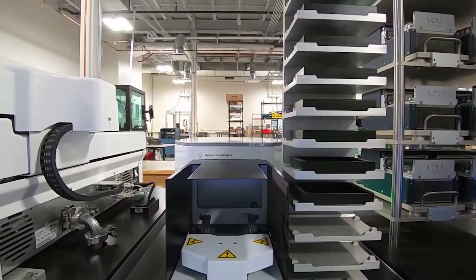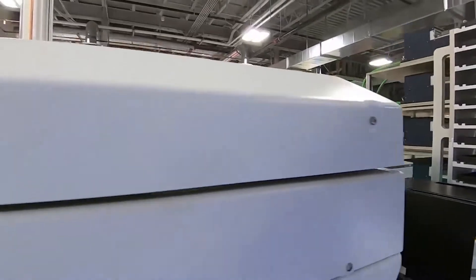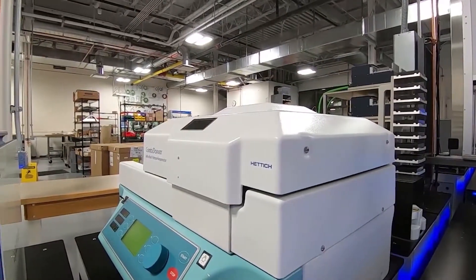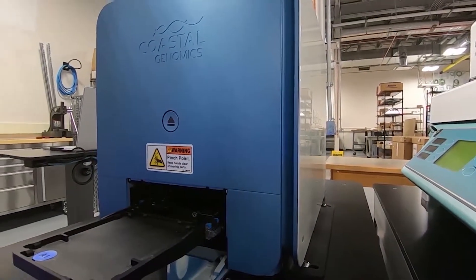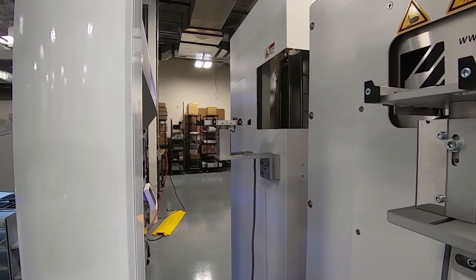We have another centrifuge and then our combi dancer. There's one step where you have to dry down the samples before hybridization, so we went with the combi dancer to dry down those samples, because no one really makes a fully automated vacufuge.